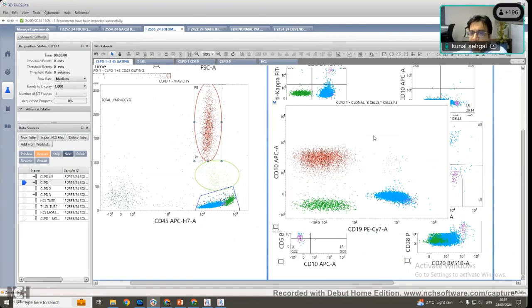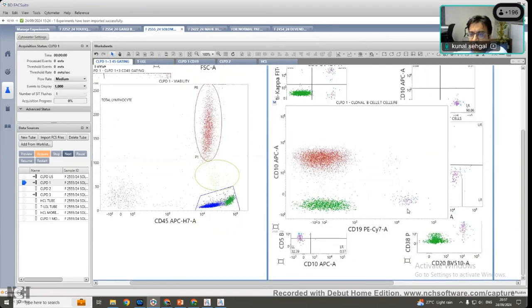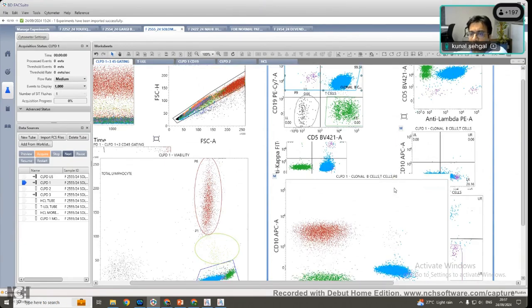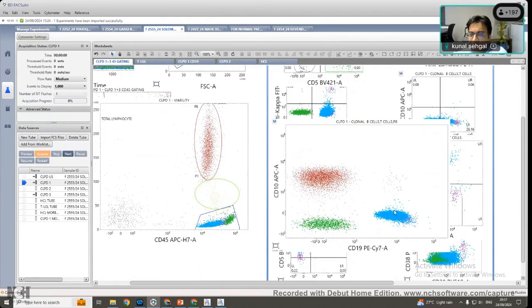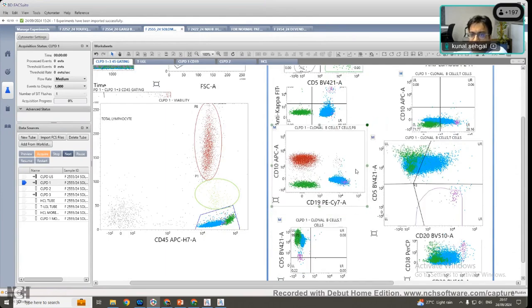I have the confidence to label my blue cells, my tumor cells, as negative because first I study my internal normal controls. Mature B lymphocytes are CD19 positive and CD10 negative. Mature neutrophils in brown are CD10 positive and CD19 negative. Then when I get my tumor, I can confidently say, yes, my tumor is negative for CD10. So identify both normal negative and normal positive, validate your panel, then show your expression. In any plot, first identify normal; abnormal is very simple.